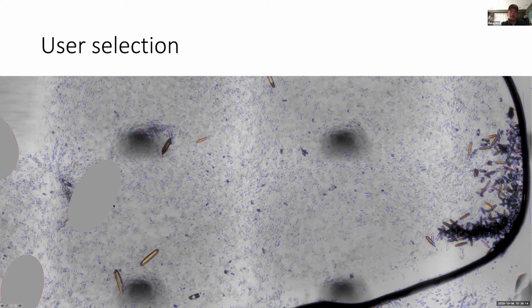There's no way you can get quality data out of them. And this is a trick I learned from single particle cryo-EM. I just doctor this image and block it, pretending there's no crystal in it. So the software will not visit any of them. That will save a lot of trouble. That's another potential strategy.